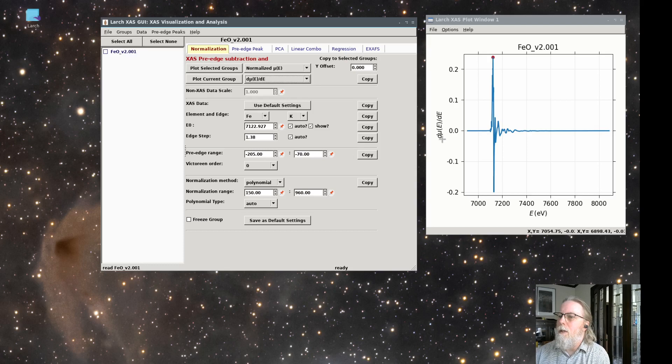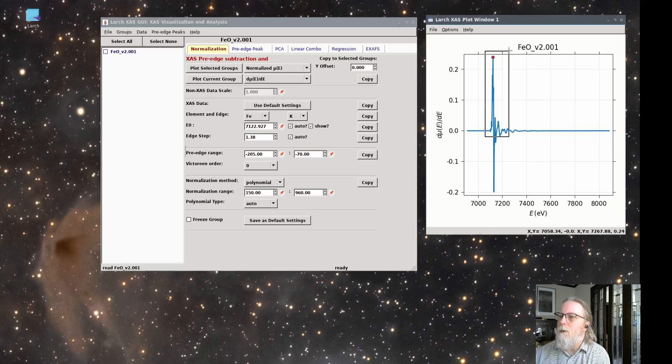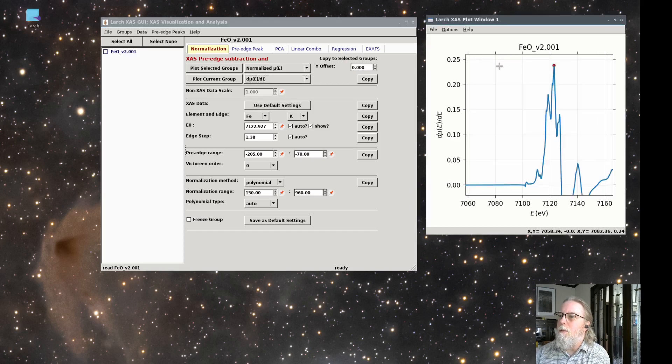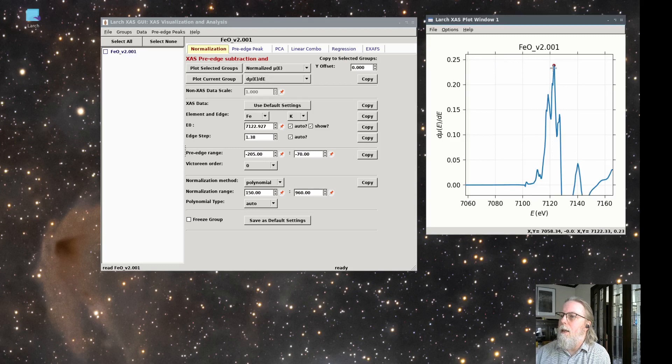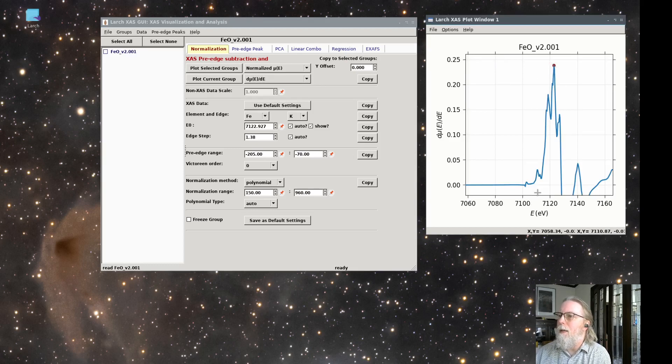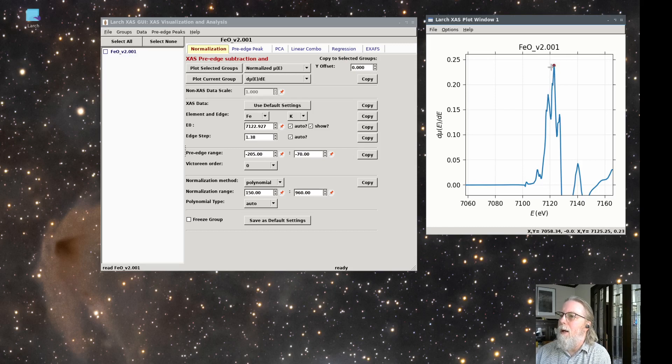So here is the derivative, d mu dE. If we zoom in on that, you can see that the maximum value for d mu dE is around 7120 something. That's where the red dot is. That's 7123.